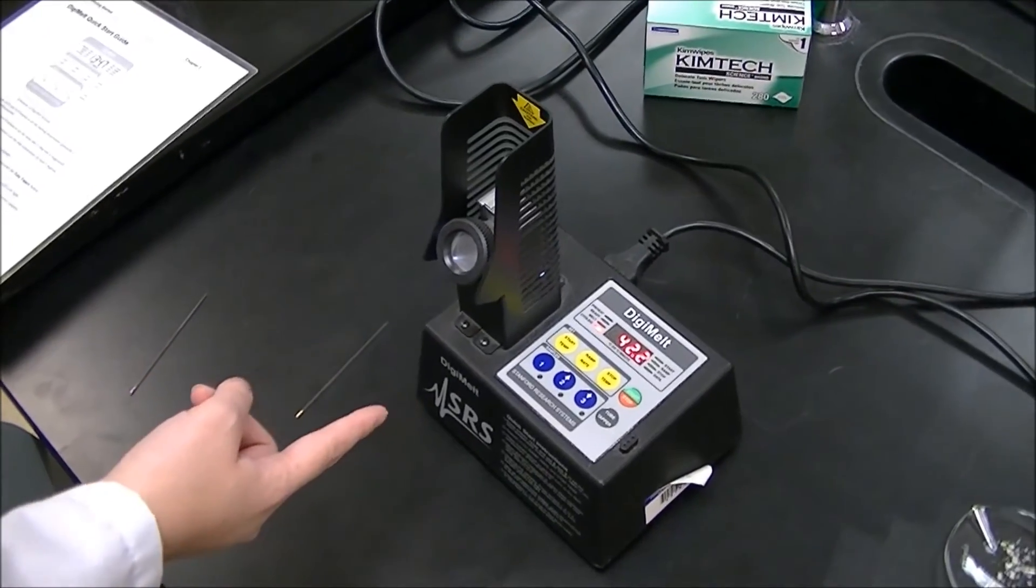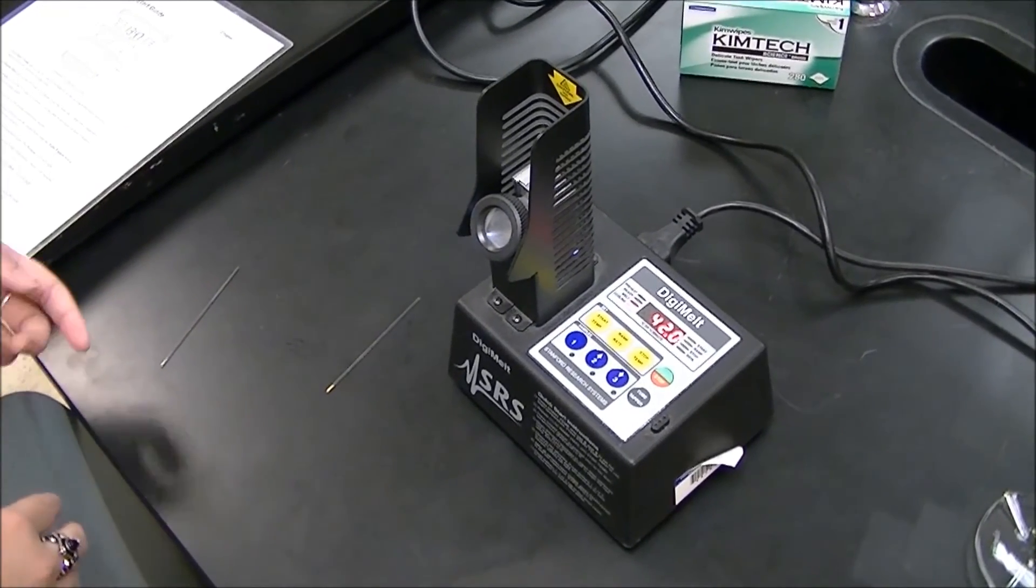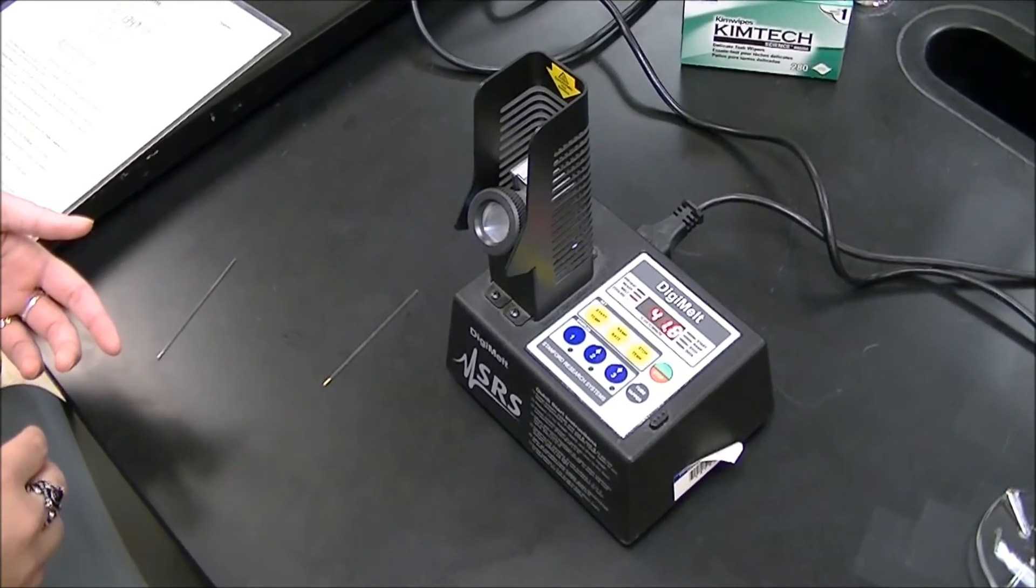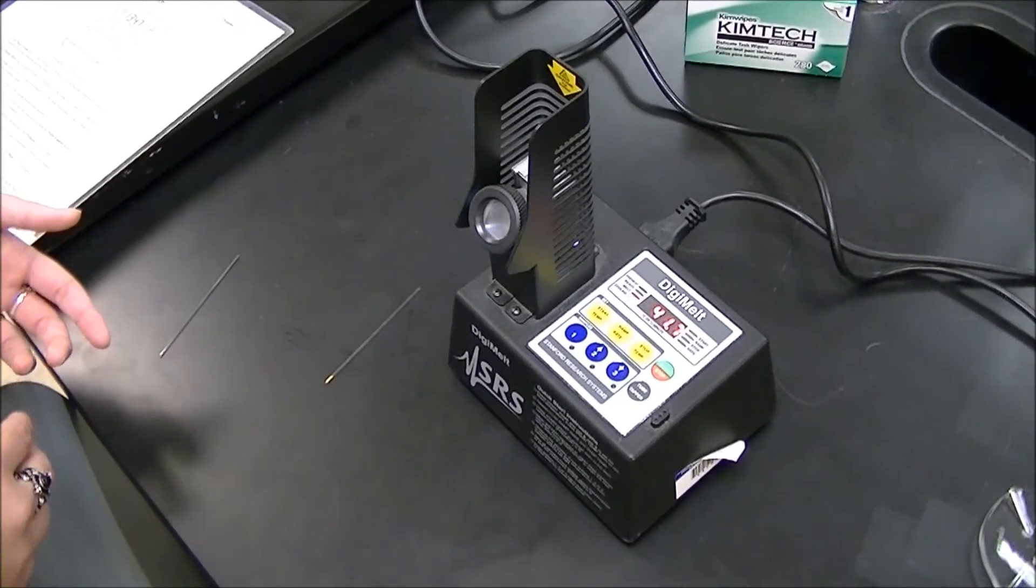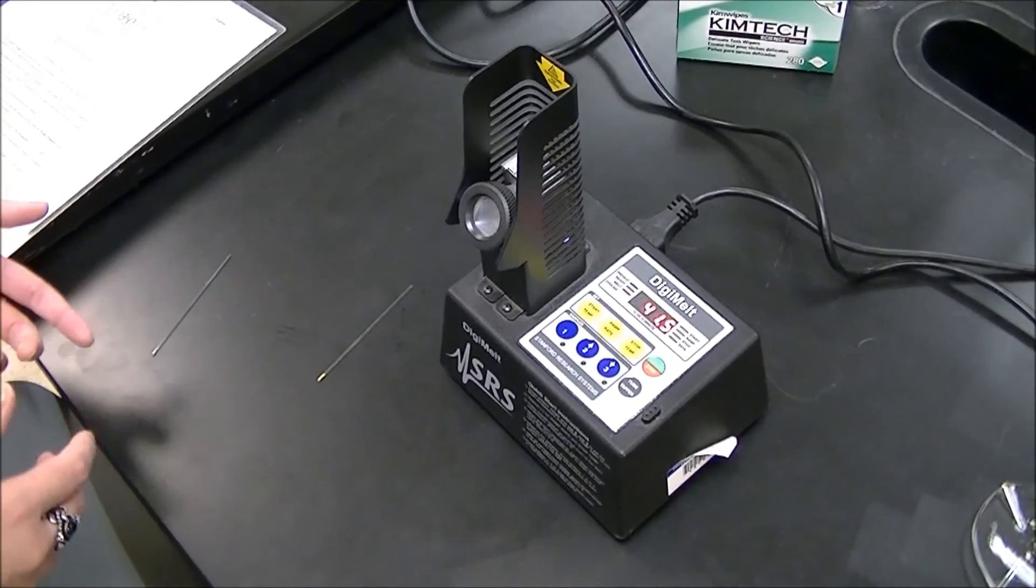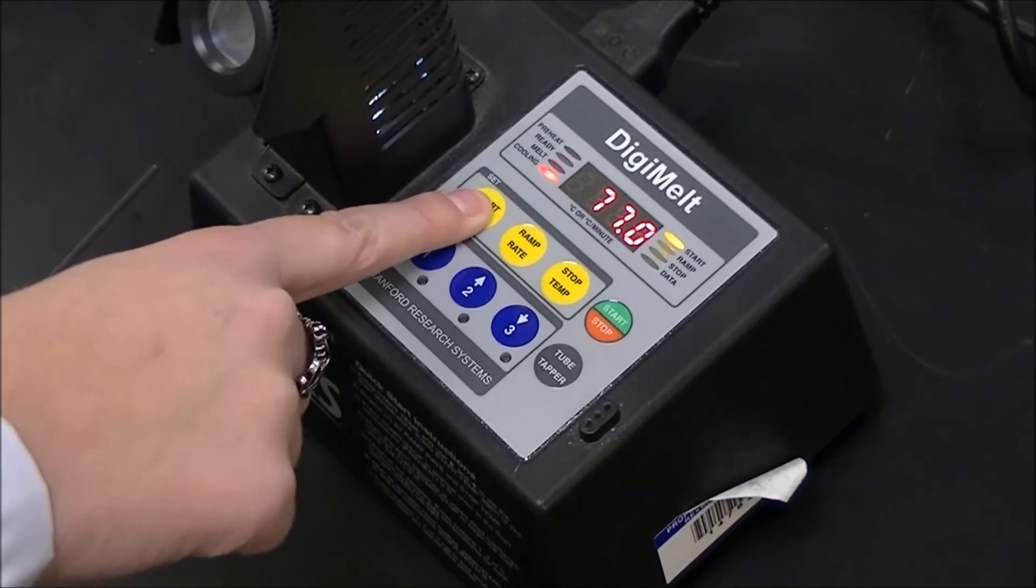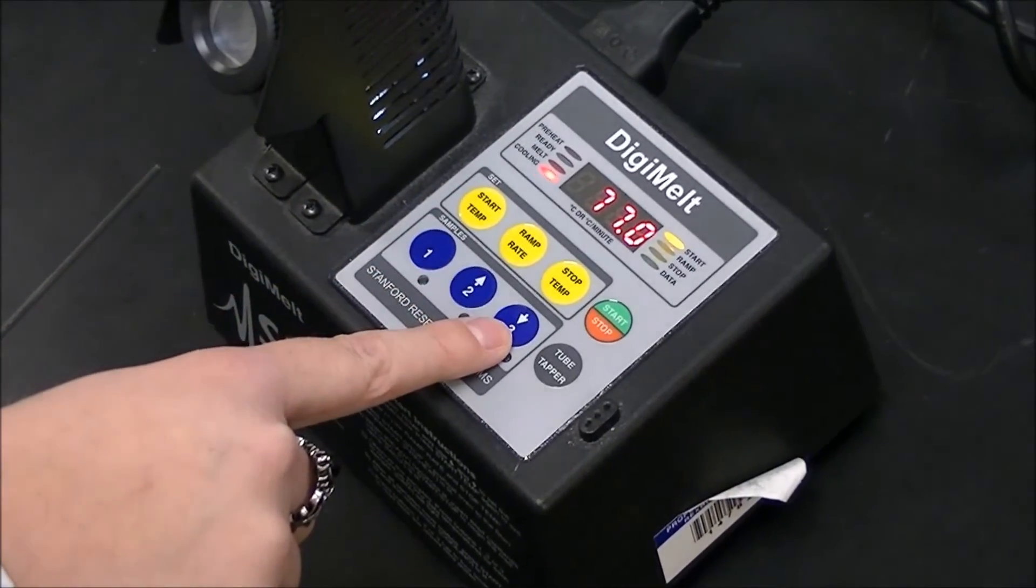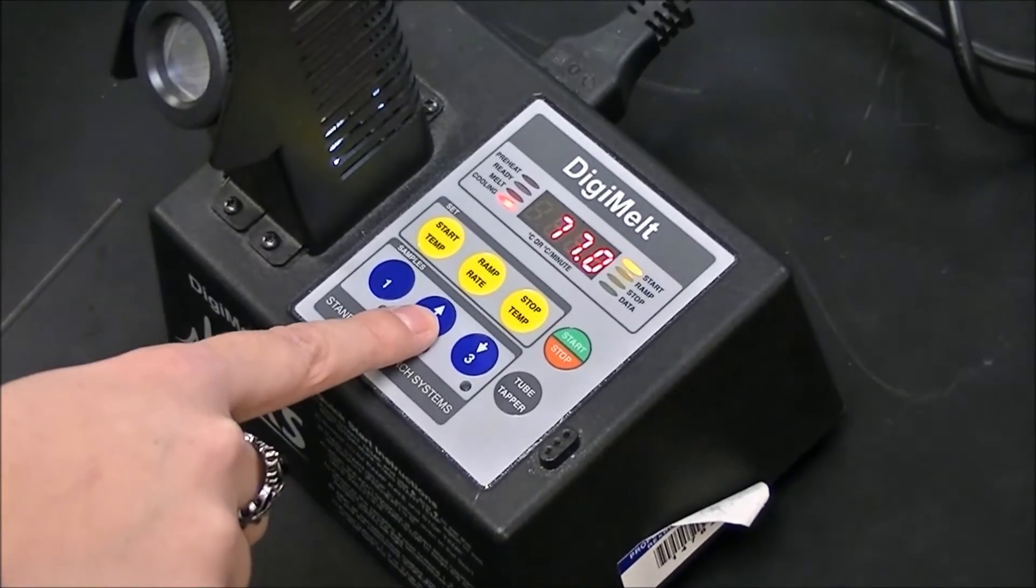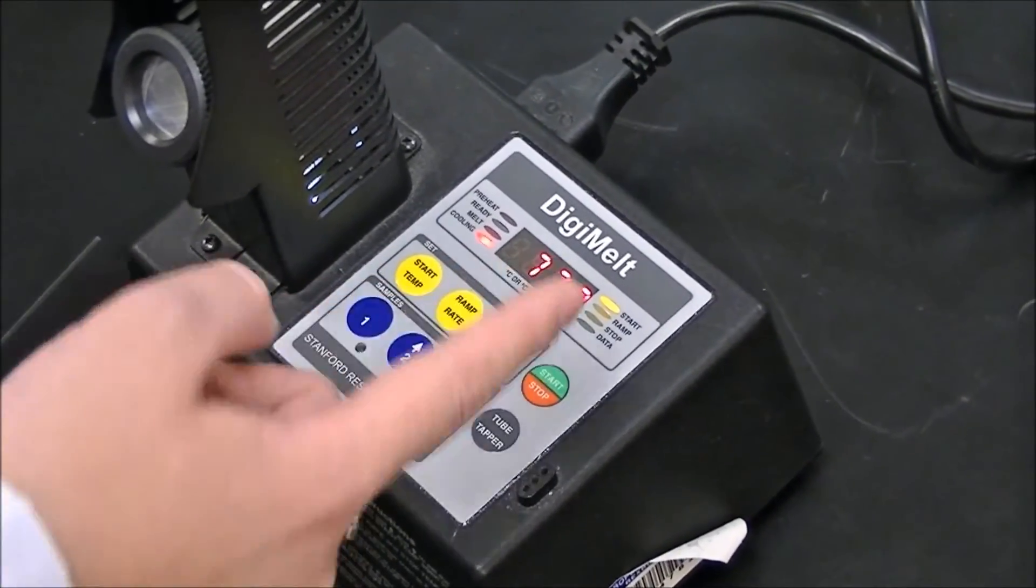So this is the digi melt, and we're going to be sampling our 9-fluorenone sample first. 9-fluorenone has a melting temperature between 80 and 83 degrees Celsius. We're going to choose start and stop temperatures that are slightly lower and slightly higher than that range. Push the start temperature button and use the up and down buttons to make sure that this number is slightly lower than the 80 degrees Celsius for 9-fluorenone. So we set ours to 77.